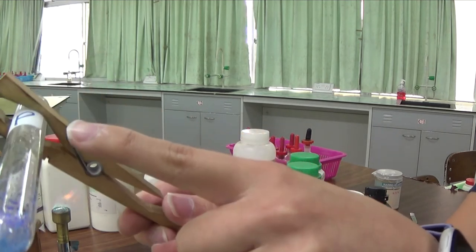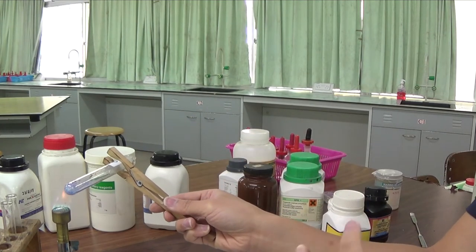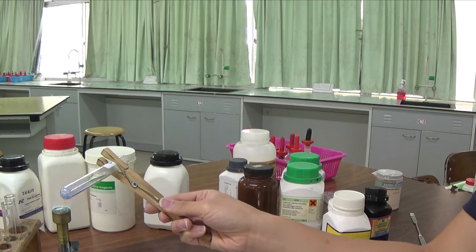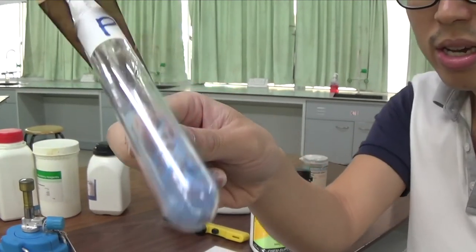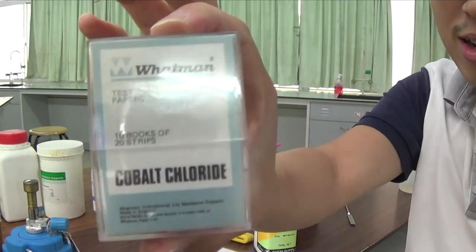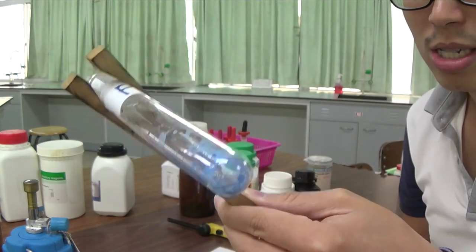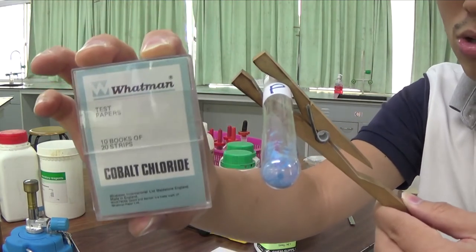This is a white sticker, but these are colorless liquid formed on the upper part of the tube, and that is a result of the water of crystallization being driven off by heat, and the water of crystallization boils off as steam or water vapor. And now, this is what you call anhydrous. Anhydrous cobalt 2 chloride is blue in color. It's supposed to be the color of this thing called cobalt chloride paper. This is anhydrous cobalt 2 chloride, which is what we use to test for water. Anhydrous cobalt 2 chloride is blue. This paper is supposed to be blue because it's supposed to contain anhydrous cobalt 2 chloride.